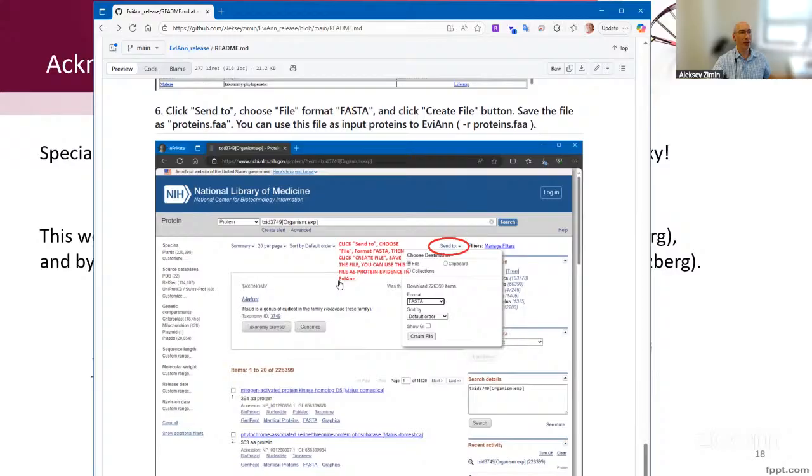errors to propagate. So EviAnn will find novel proteins. The avenue to find novel proteins is when, for example, you have a chunk of a protein from a related species that matches a transcript, and EviAnn is able to extend it for the entire transcript, potentially producing mostly new protein.